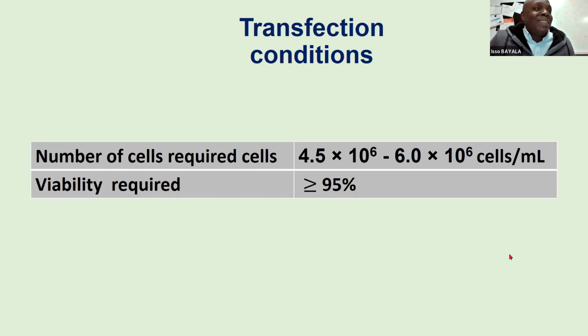We monitor the cells and count the cells. Sometimes they take about 3 days, sometimes 4 days. Sometimes you have to centrifuge, collect the pellet, and change the media. All of these happened when I was doing this. And one time I got a contamination and had to do it over.